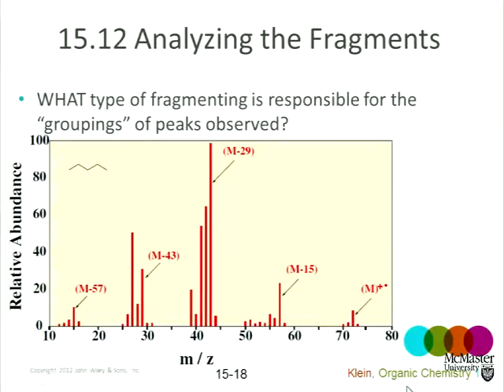Notice that the intensity pattern here is different. The best fragmentation, the most common fragmentation, the one that gives you the highest relative abundance, is actually fragmentation down the middle to make the propyl cation and the ethyl radical. We haven't seen this yet, but along the way in this course you'll learn that positively charged carbons, carbocations like CH3+, are less stable than ethyl or propyl and so on. More alkyl groups in a carbocation gives you more stability, and we'll come back to that point as we look at the SN1 reaction in chapter 7. But effectively that is causing this uneven distribution of fragment ions.